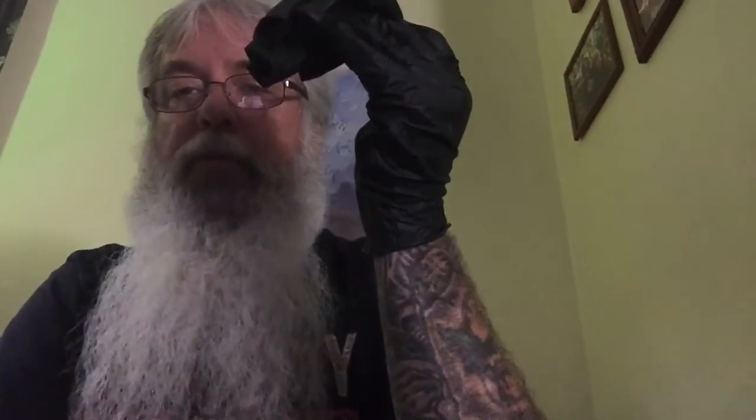With your dominant hand — mine is my left — find a point about half an inch from the cuff of the other hand and pinch the glove with your thumb and forefinger. Pull the glove from your non-dominant hand in a slow and steady movement so you do not make it snap or cause it to throw debris or sweat into the surrounding area.